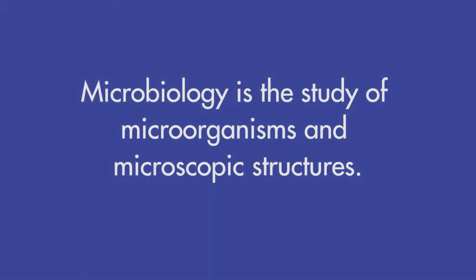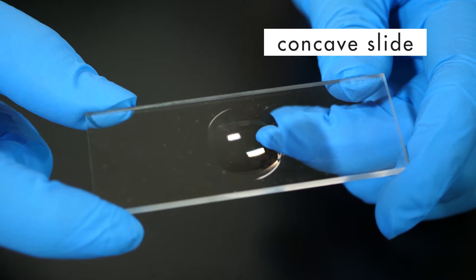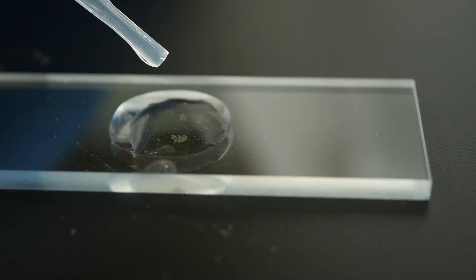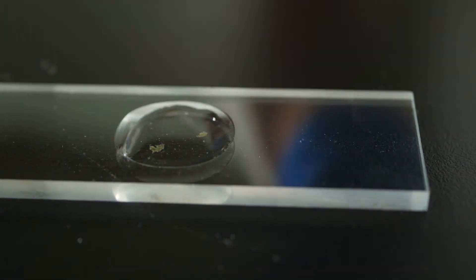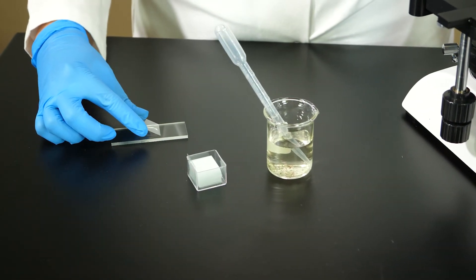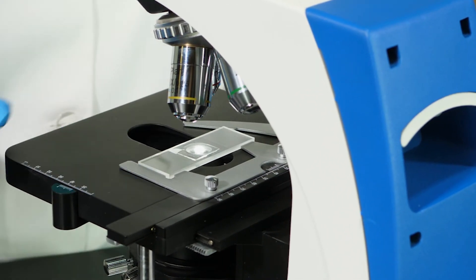Now, we will put our knowledge of the microscope to use as we explore the world of microbiology. Microbiology is the study of microorganisms and microscopic structures. We will examine some of the microorganisms living in pond water. A concave slide has a concave depression to hold a greater amount of water than would be possible with a flat slide. We place several drops of pond water in the depression of the concave slide and then cover it with a cover slip.